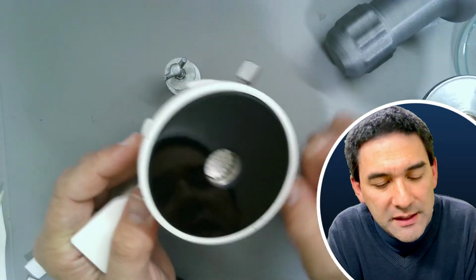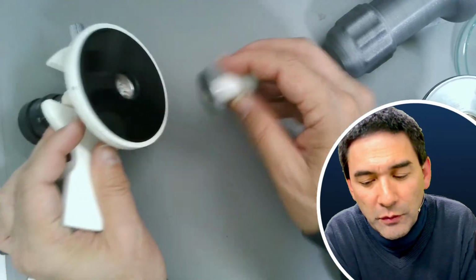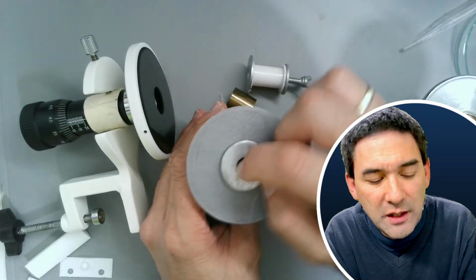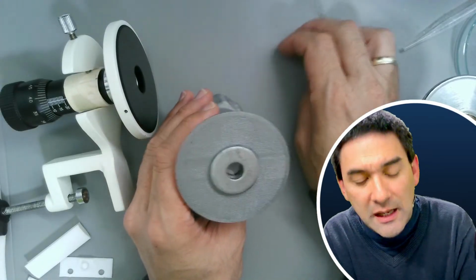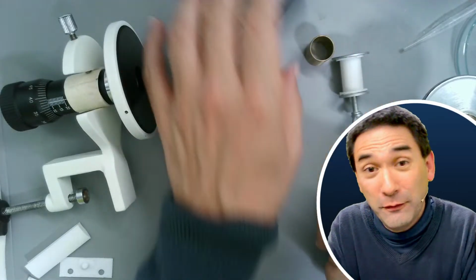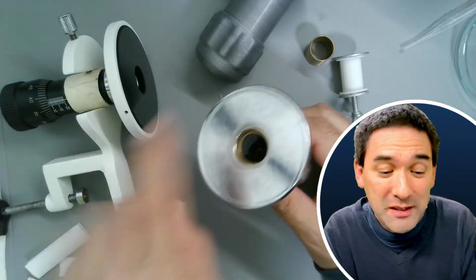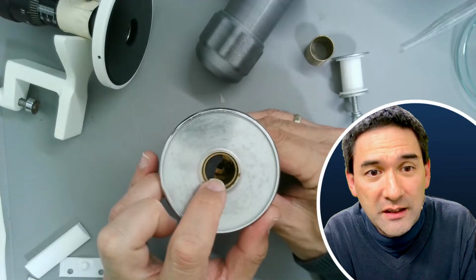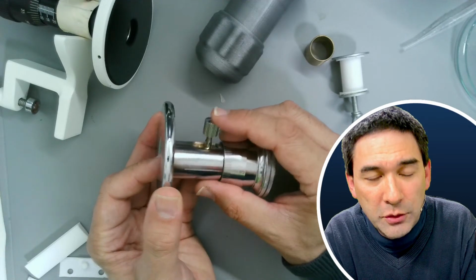So in that sense, this nice microtome suffers the same problems as this one over here, because there is no inside clamp. And now I'm going to show you the one that does have a clamp, but which is actually of lower quality, but it still works better than some of those others. And that is this one over here. You see there is this tiny plastic clamp, which you can move by turning the screw here on the side.